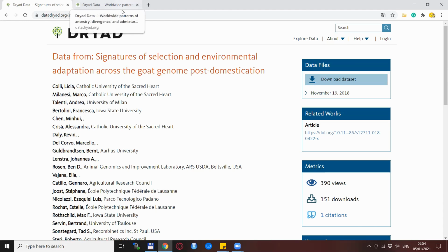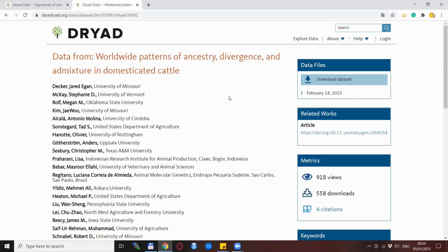The other data set we will be looking at in this video is from the publication from Decker et al. Worldwide Patterns of Ancestry, Divergence and Admixture in Domesticated Cattle. Likewise, there is a download button and you can download this one as well.